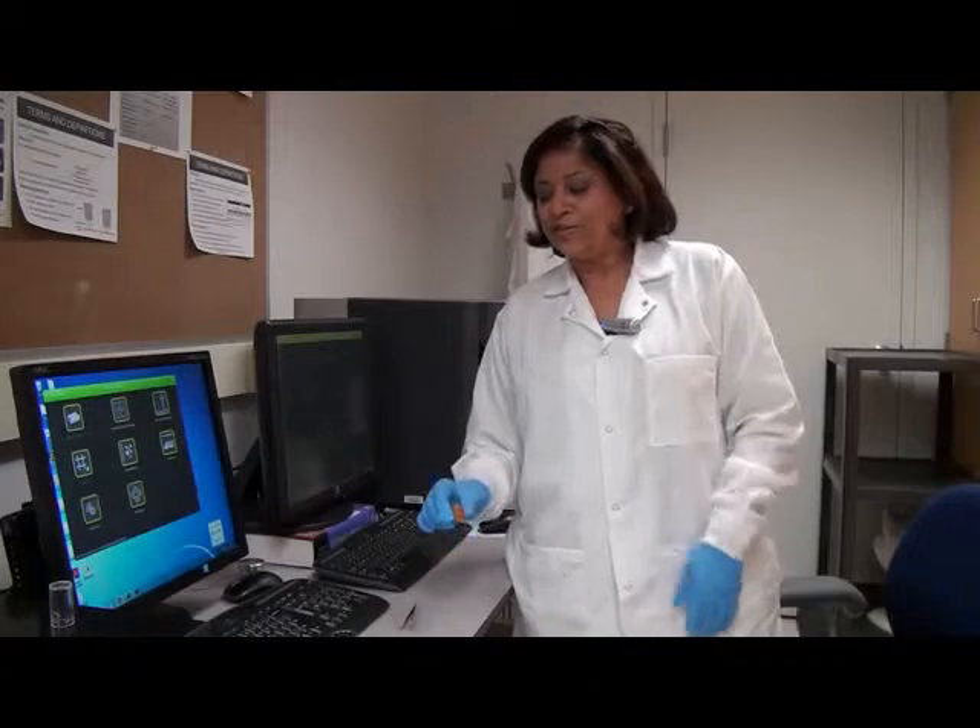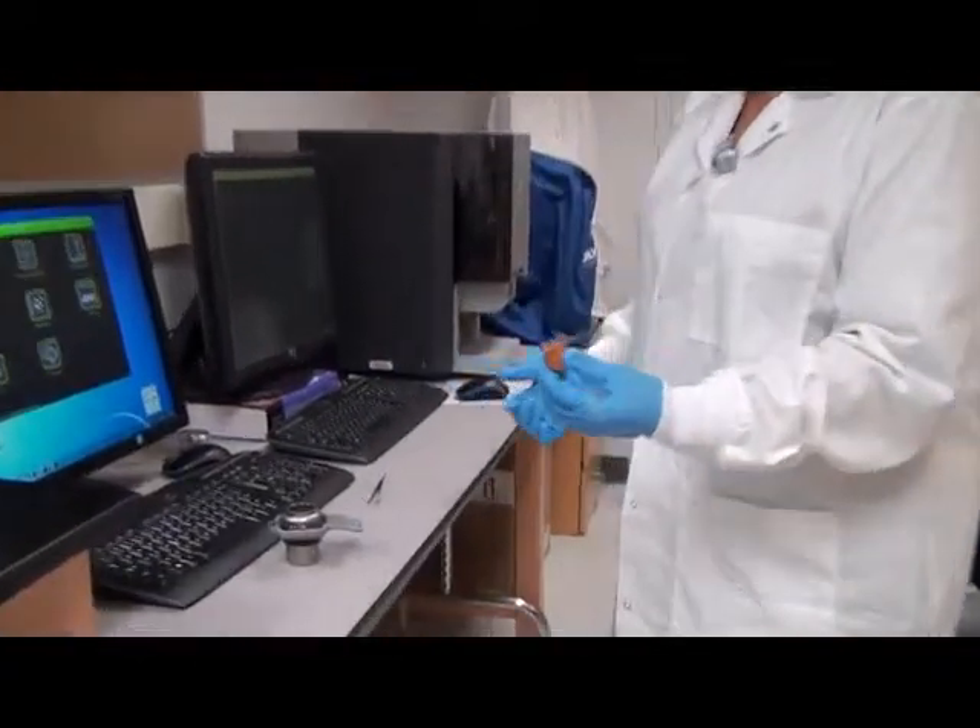Now we are going to see some of the specimen under the scanning electron microscope. You just saw a bug under the light microscope and now we are looking at another bug under the electron microscope.